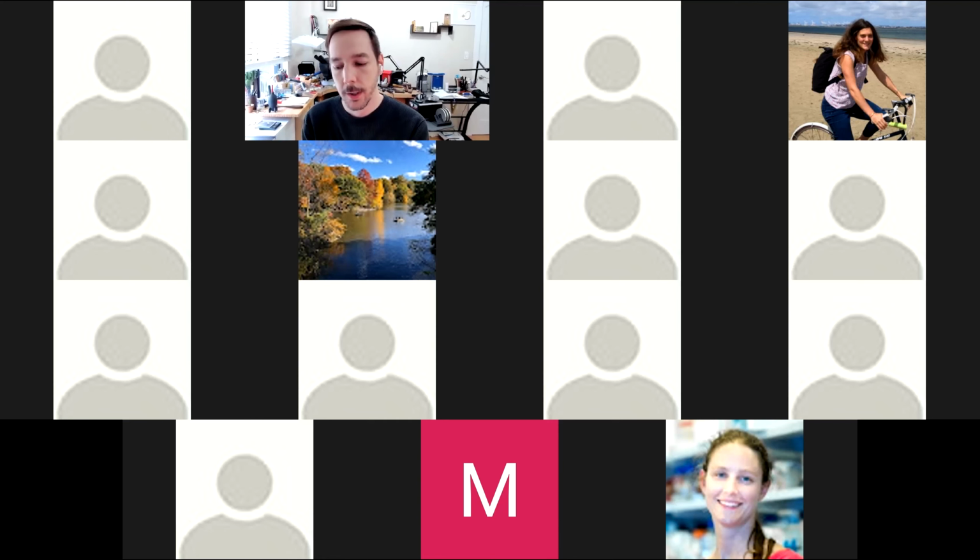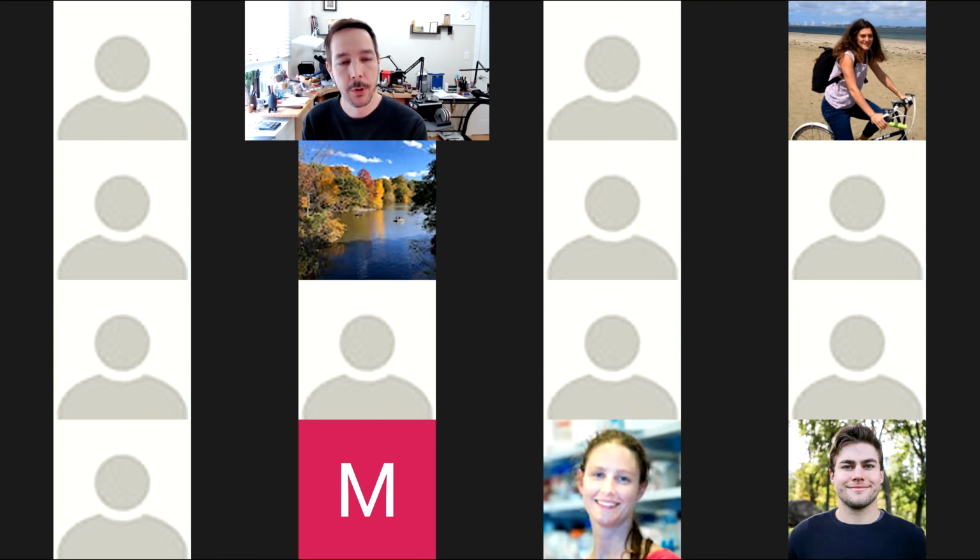And I think, for most things now, especially now that we have access to things like machine learning and deep learning, most problems that used to be intractable are now accessible to almost anyone with just a little bit of effort. The idea of this tutorial is that it's going to be a crash course in basic scripting, and hopefully a launch pad for you to think about how you can tackle more complex problems. And if you join next week, you'll learn how to incorporate machine learning and deep learning into these types of pipelines.